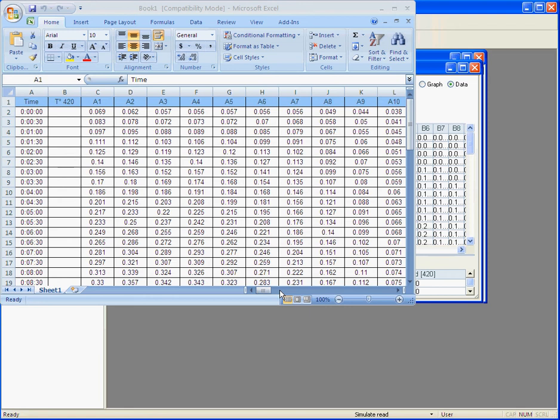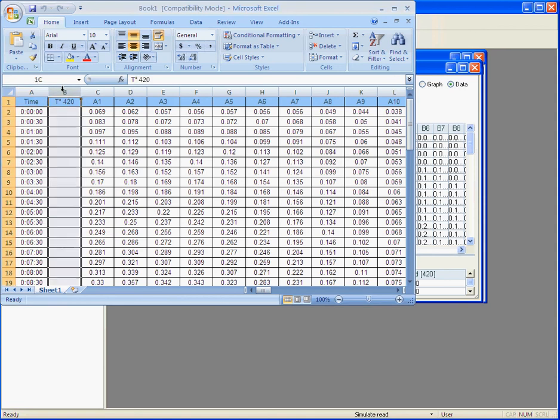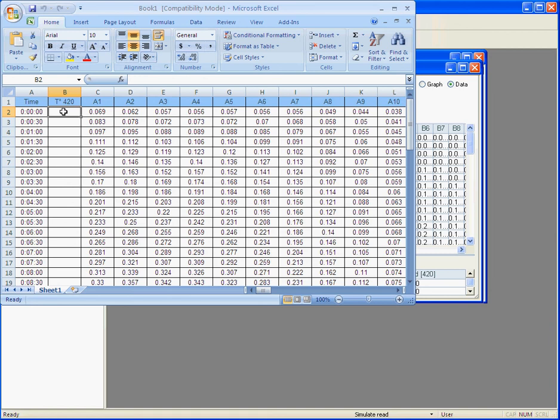One new feature in Gen5 20 as well is this column that you can see right here. The temperature is now reported. This column is empty right here because this is simulated data, but if you had used a reader with temperature control to generate this data, you would see the temperature for each time point.